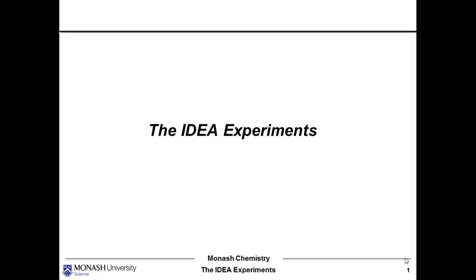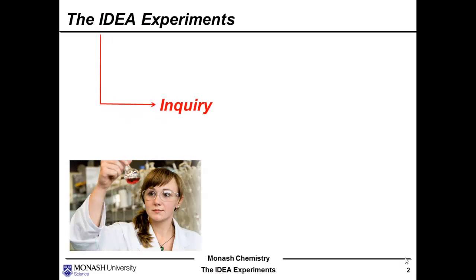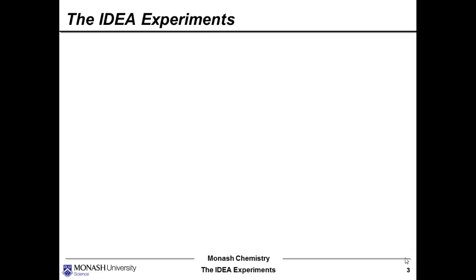We've thrown away the traditional model of giving you a recipe, and we're asking you guys to design the experiment yourselves. The name idea experiments really comes from an acronym which is derived from inquiry, in other words, asking the right questions, designing an experiment, exploring, in other words, performing that experiment, and then maybe even answering the question that you asked at the very beginning. Sometimes you might find you're a little bit surprised.